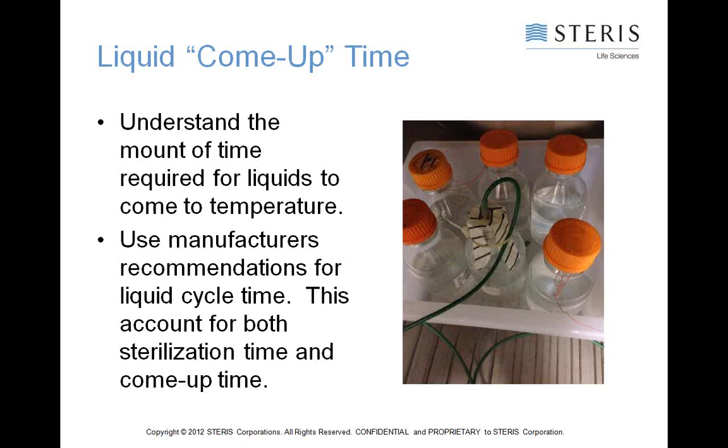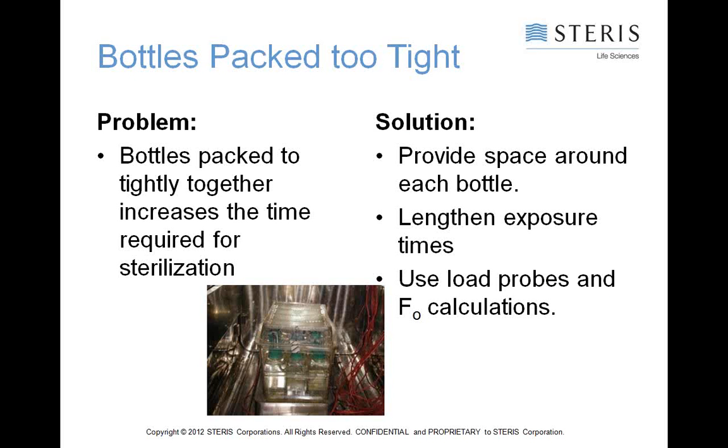And then watch the way you pack bottles. Bottles packed together tightly will increase the time required for sterilization. Say it might take a 20 or 30-minute cycle exposure time to do 200-300 milliliters of water. But if you pack it all together, you want to treat that as one big amount of water, so 1,200, 1,500 milliliters of water if they're all packed together with minimal space for the steam to get in and out. So provide space around each bottle, lengthen exposure times if necessary, use load probes and F sub-zero calculations.